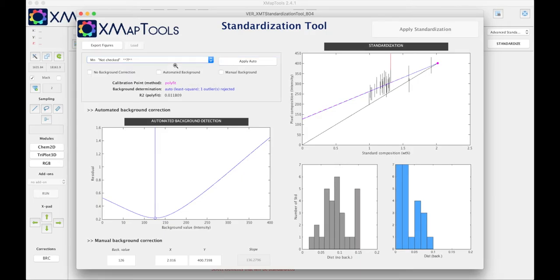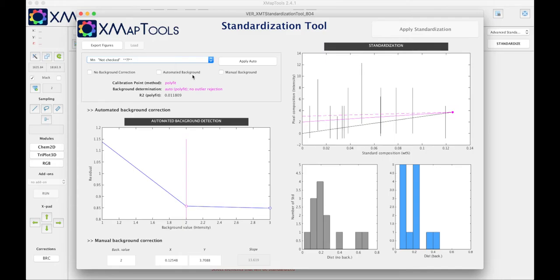Now let's do manganese. For manganese it's a bit different because we have very low count rate in the map between two and three x-rays, whereas we see a variation in the spot analysis. This means that we are below detection limit for the map condition. Manganese map should be zero.